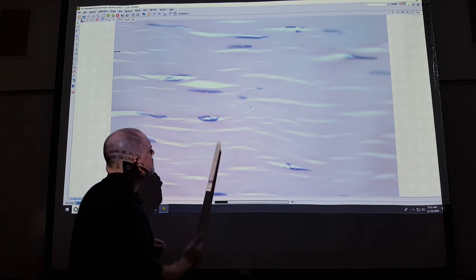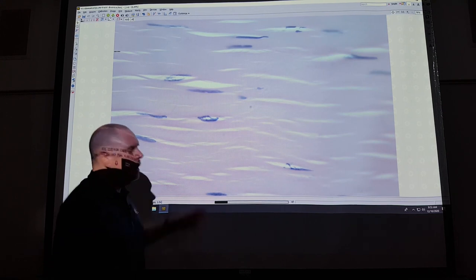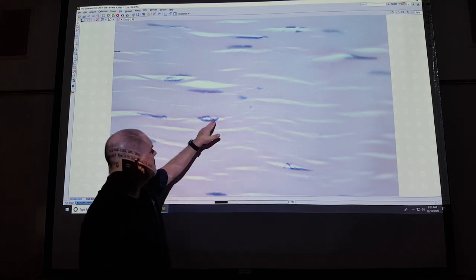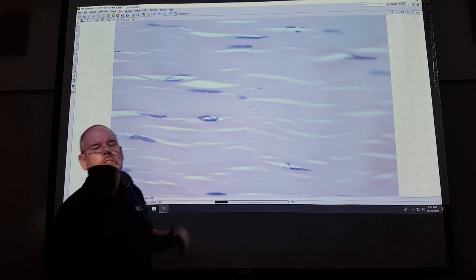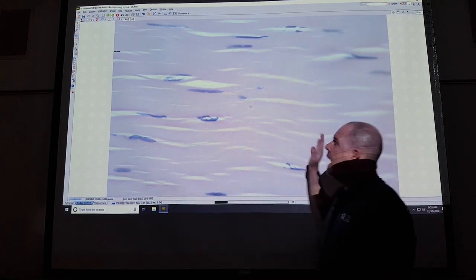The other thing is, once in a while people confuse the fibroblasts here with the multinucleate appearance of skeletal muscle fibers. Notice these things exist between these collagen fibers, not inside skeletal muscle cells. So dense, regular connective tissue.